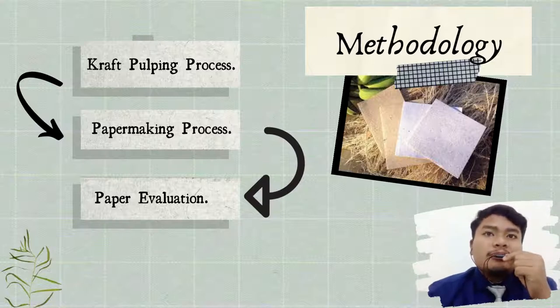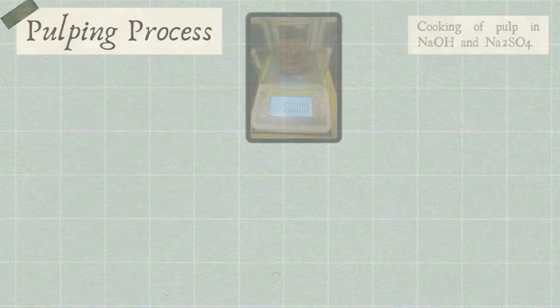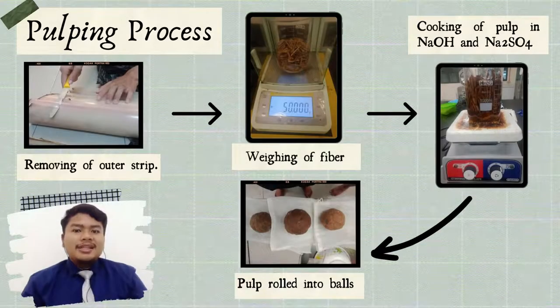Three big methods are very important for success in this project. Firstly, kraft pulping process, paper making process and paper evaluation. Kraft pulping process. In this process, we want to make banana fiber. Next, dry the fiber in the sun. Then, cut the fiber into small pieces using scissors and weigh 50 grams of fiber for cooking.